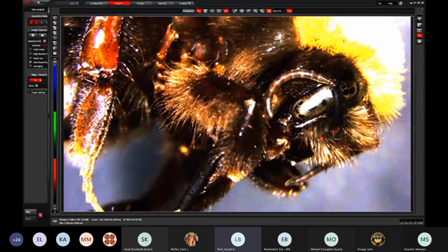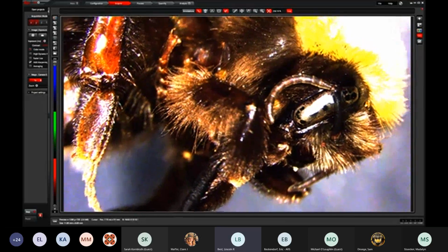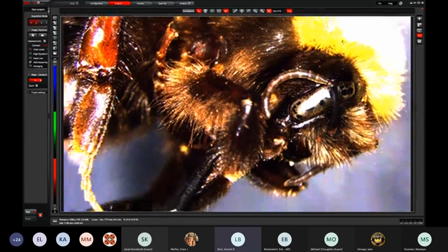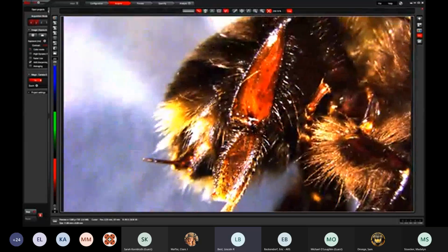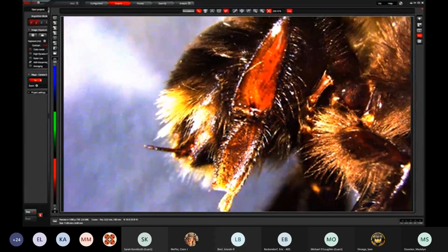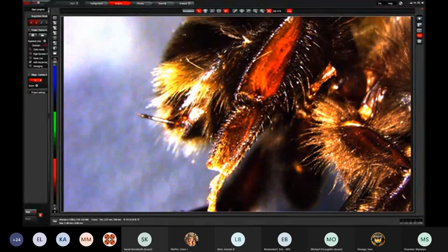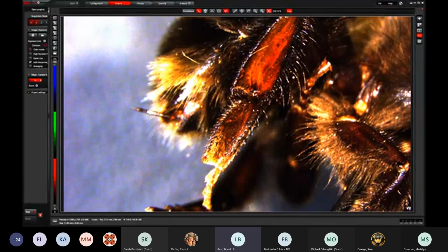See if I can left hand the specimen, right hand the mouse. So it only extends to about here, very short malar length relative to its width. What else might we look at on this specimen? We can look at that hind leg basitarsus. It has a longer, narrower proximal, posteriorly directed process here.